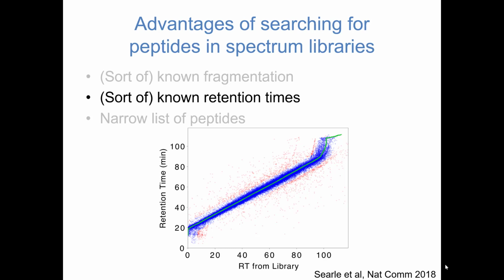Typically, I think, Brendan, when we do DIA extractions, usually we think about plus or minus 10-minute windows. Is that about right? Well, 7 and 5. So, yeah, plus or minus 5. Okay. But if the library is built on the same sequence, the retention time is much more accurate, yeah. It should be much more accurate.